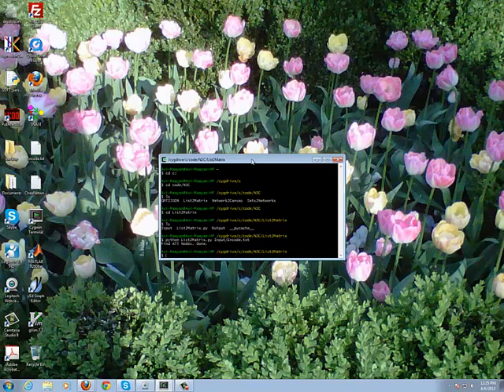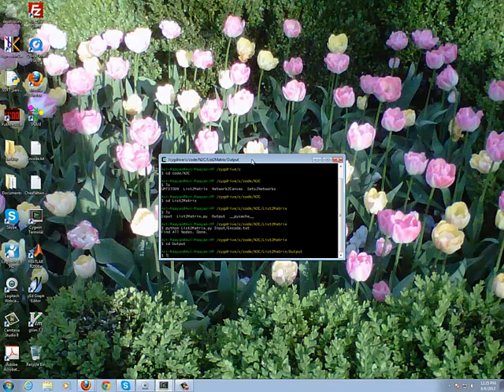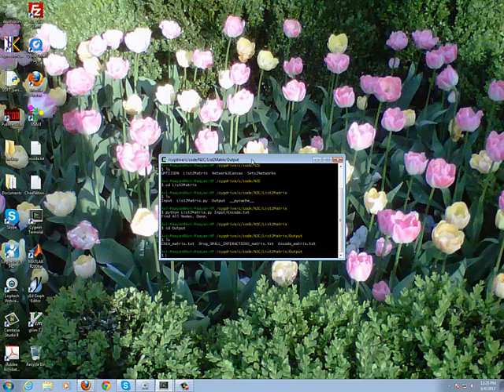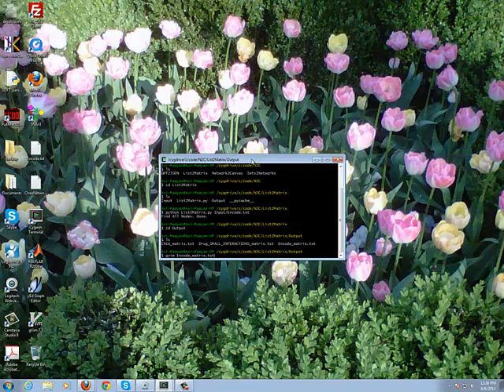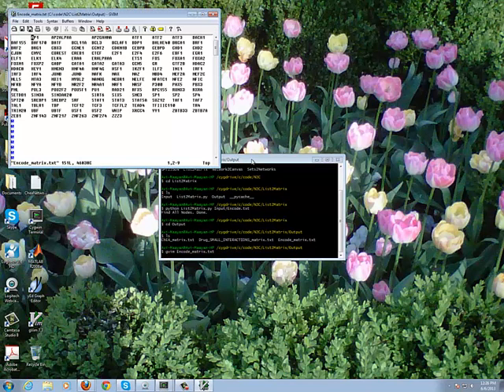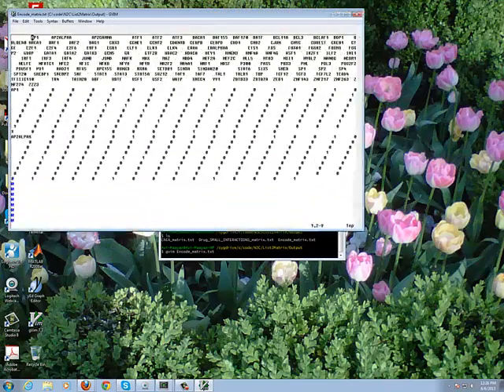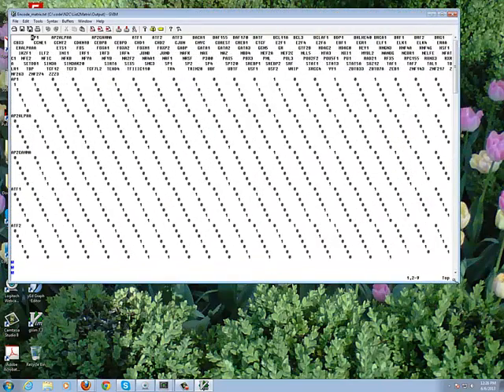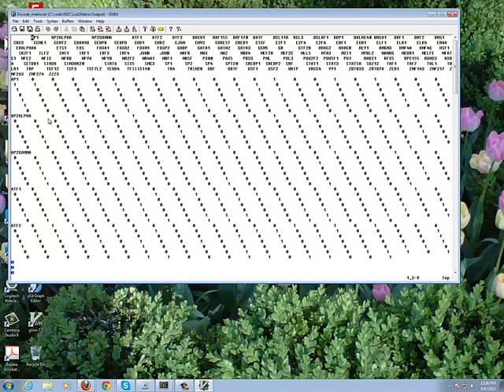So now we should find the output of that script in the output directory. So we can browse to the output directory. We can list it. And we can view encode_matrix.txt.